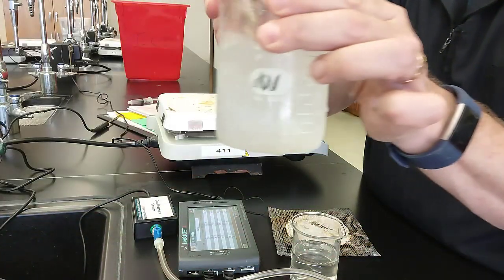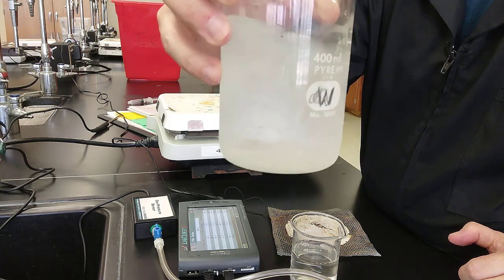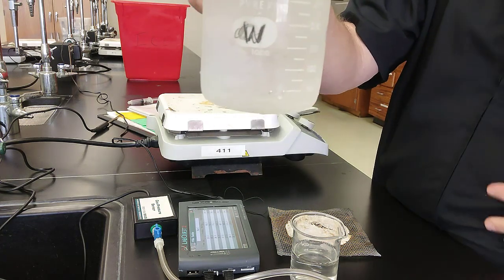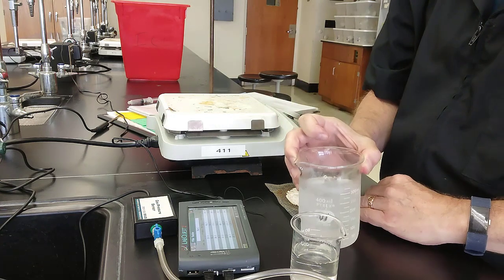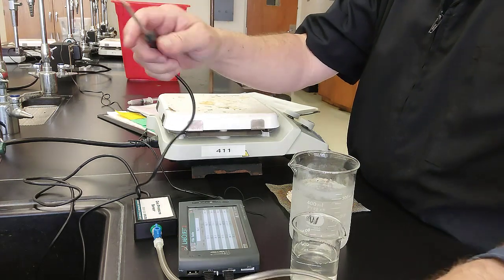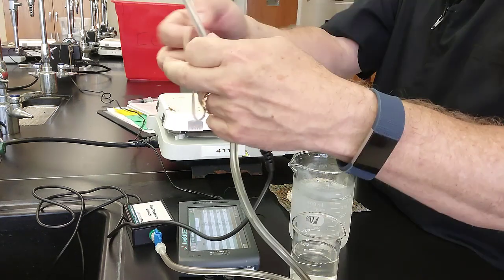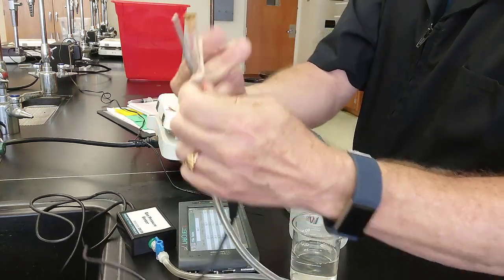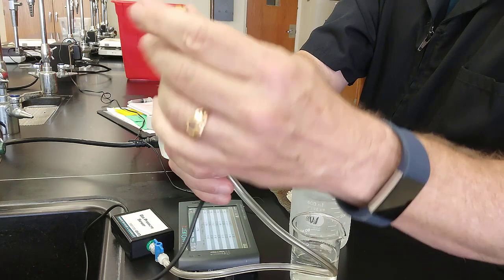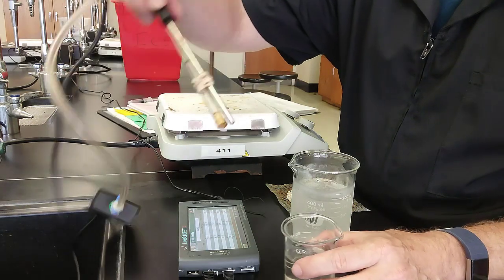Okay, so now I have ice water, and the water will be at the temperature of the ice, and we'll have a nice cold environment to put our beaker into. I am going to get a temperature probe, which is already hooked up to my LabQuest, and I'm going to rubber band it right onto my stoppered dropper. Okay? And now I'll be able to dunk this guy in there.